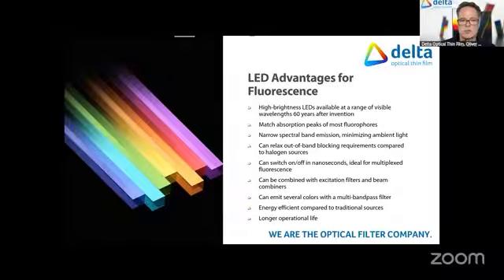And because you do not need to block so much light in the broad wavelength range, also the requirements on the blocking capabilities of the filter can be a little bit more relaxed. They switch very fast within nanoseconds. So that's, of course, then ideal for multiplexed measurements.